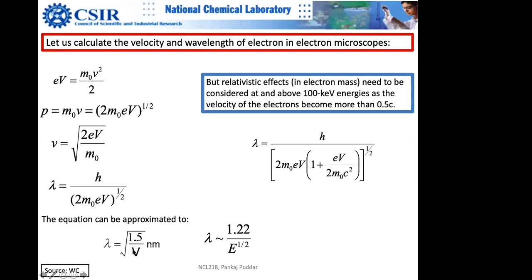So obviously, you know de Broglie, so I can calculate lambda approximately. You can note it. This is quite a nice relation. I normally don't recommend cramming long equations, so I will not show many equations. It's mostly a conceptual lecture. That's how I teach. But this is still good, just a back of the envelope calculation you can do.